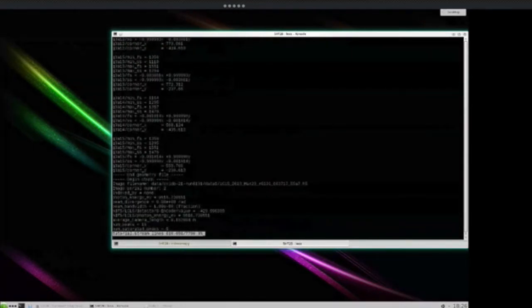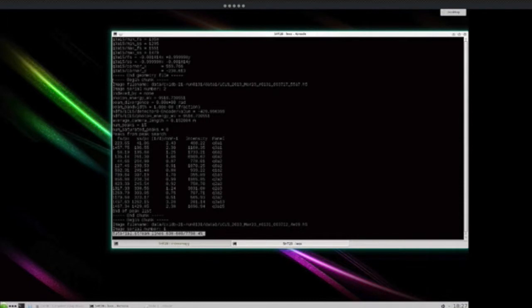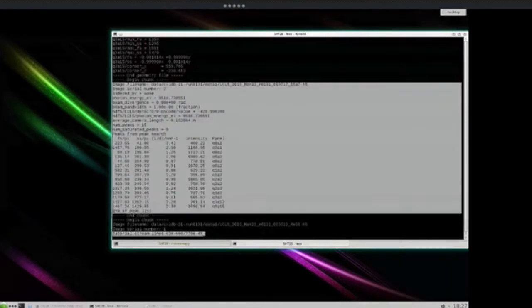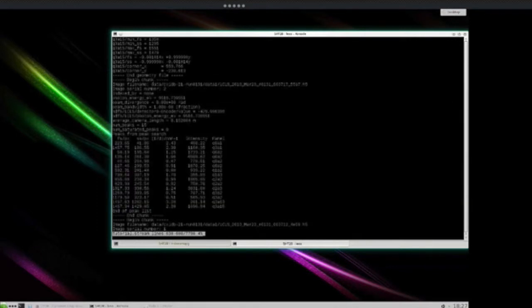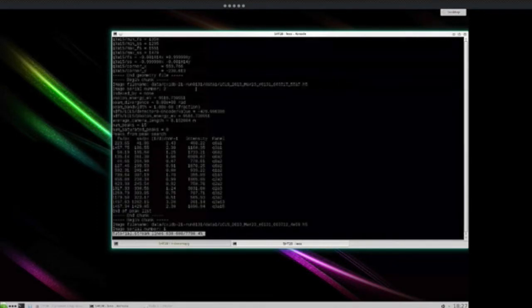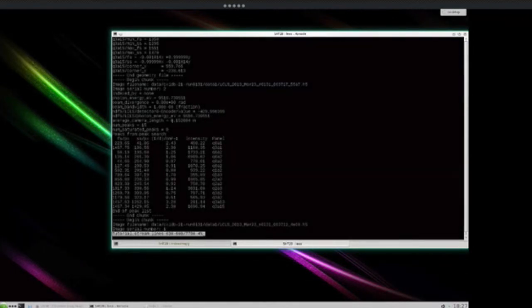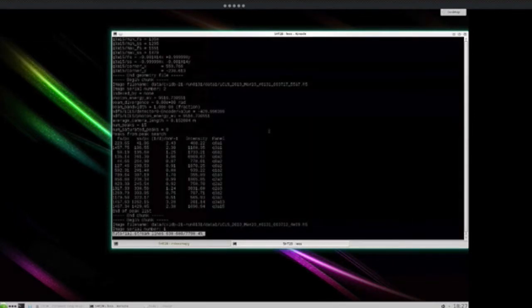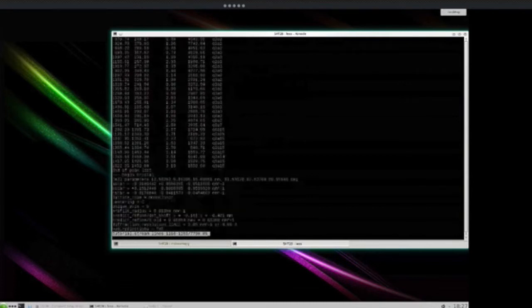Okay. Now the main content of the file is in these things called chunks. So you see the chunk boundaries here, begin chunk and end chunk. And between those is all the information about this one image. So there's the file name, the image that got processed. Serial number is just the number in which it was given into the program, so that can be useful under certain circumstances. There's stuff like the photon energy. There's the detector position information. There's the peaks that were found at the peak search stage. If I scroll down and find one that was indexed, so let's see, here's one.